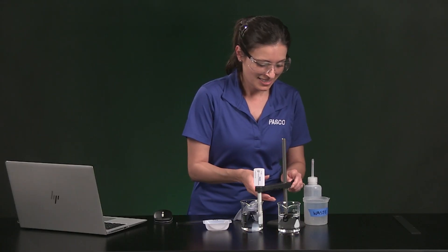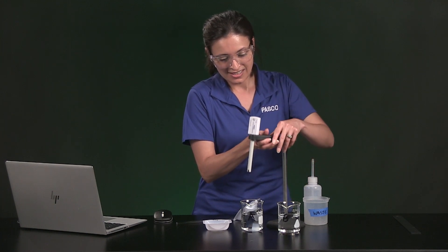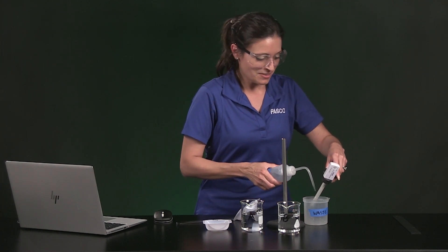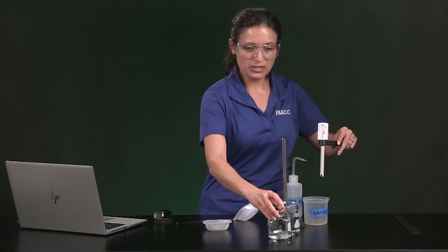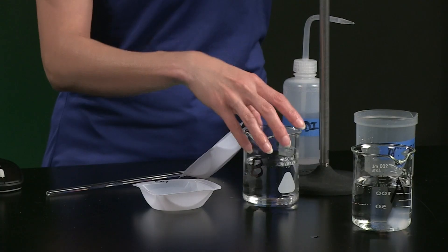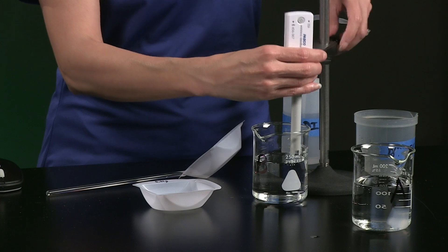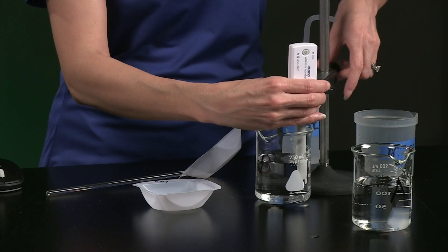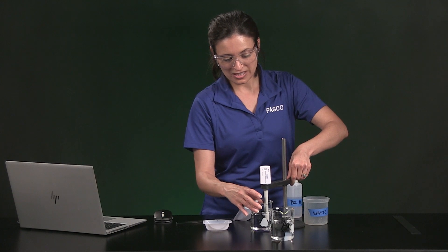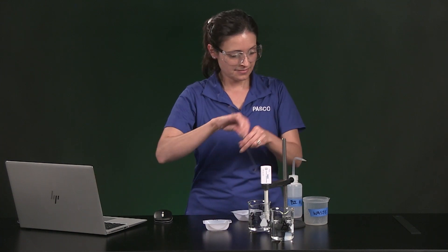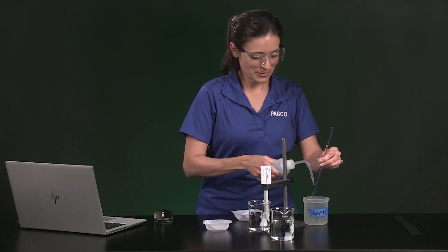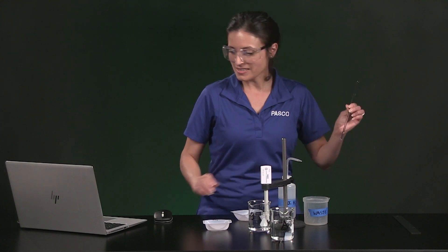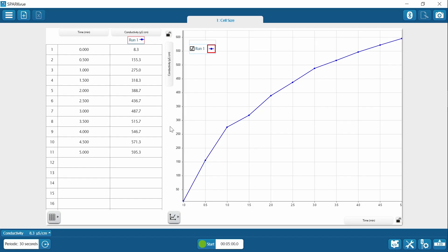Let me set up the next system. I have to clean the conductivity sensor with some distilled water. I'm going to switch to a new beaker of 150 mL of distilled water. I need to rinse my stirring rod with distilled water.